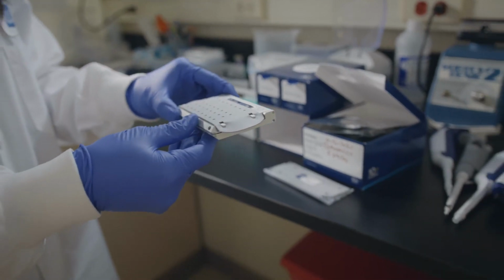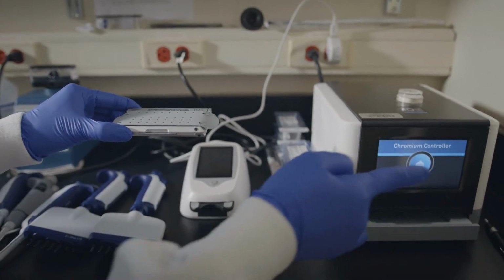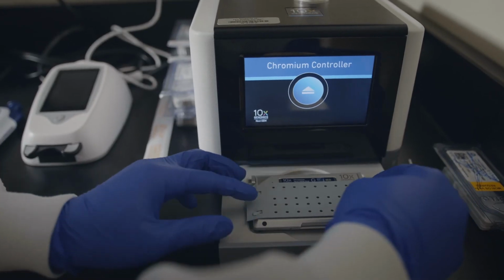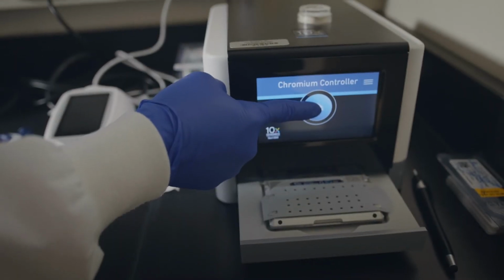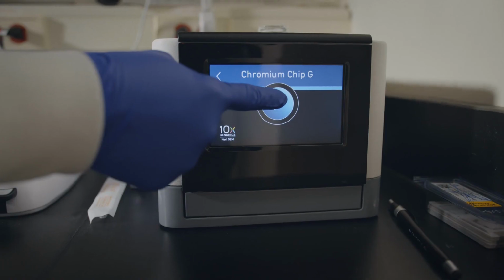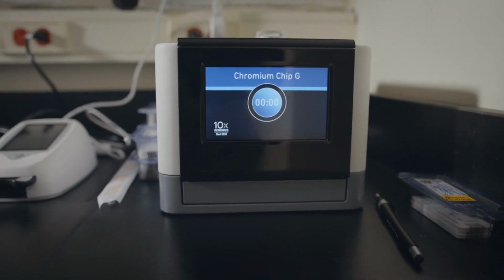The machine uses microfluidics. You know how when you mix water with oil and shake it up, you get an emulsion, and the emulsion is like teeny little bubbles. So basically that's what's going on in the 10x Chromium. You're getting teeny little bubbles, just big enough to fit one single cell. And that's how you partition each cell. In those millions of bubbles in the emulsion is one single cell per bubble.